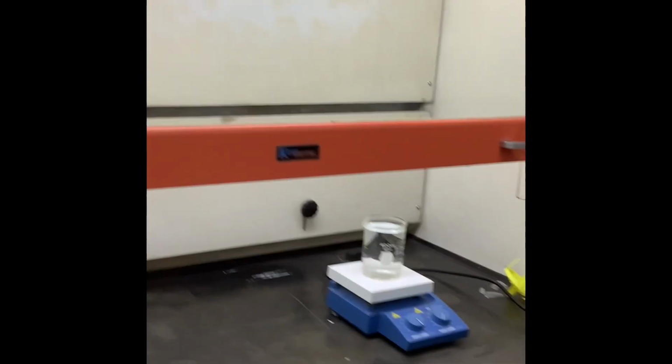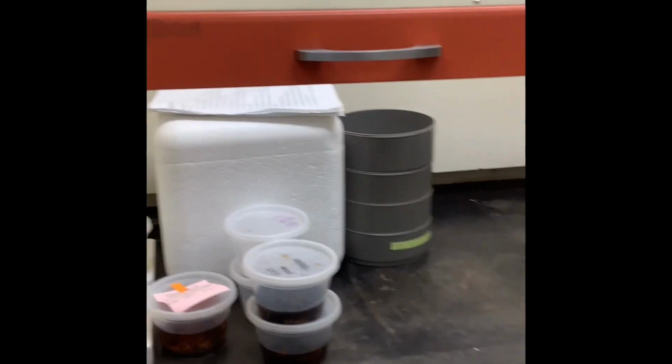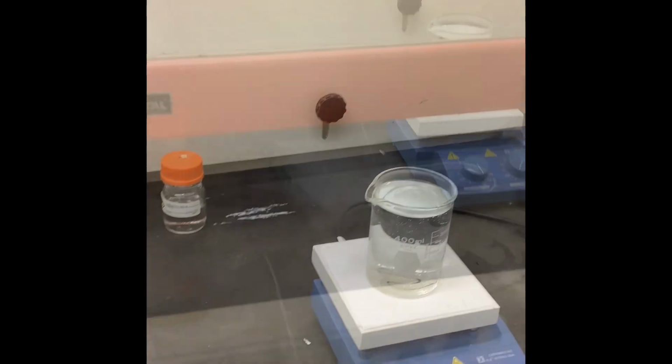Another thing is you're going to be working in a fume hood throughout this entire process. I have the sash set up really high right now, but it's going to be more like this. So you want to keep that pretty low. You can see you have a chart over here. And yeah, you'll be doing everything in the fume hood. You don't want to be inhaling any of these chemicals.